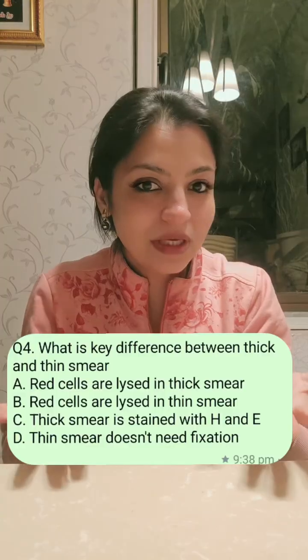Now what is the importance of pH? Remember, the pH that is preferred for malarial identification is 7.2, because at this pH, the differentiation of the parasite from the red cells is very easy. Okay, so that is why you are able to see the gametocyte, the trophozoites very nicely. So the pH here should always be, in malaria, 7.2.